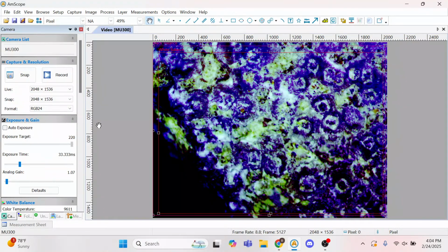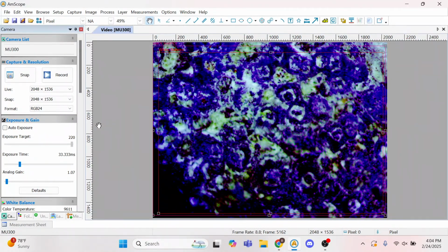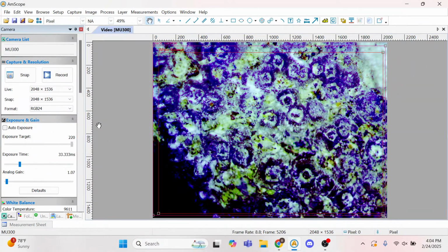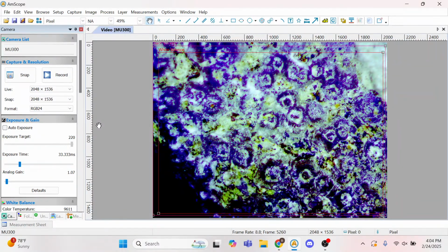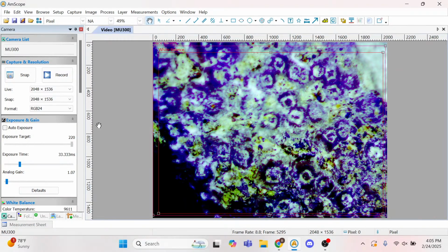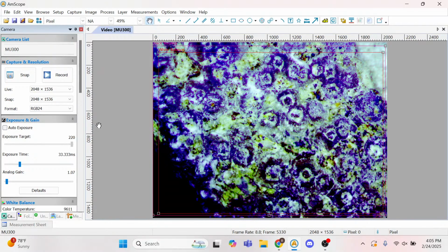I really like this cluster of pores over here. So this is the inside of the egg. Many millions of years ago, a dinosaur embryo was up against this eggshell and its various amniotic fluids, I presume? I don't know. I'll have to look that up.